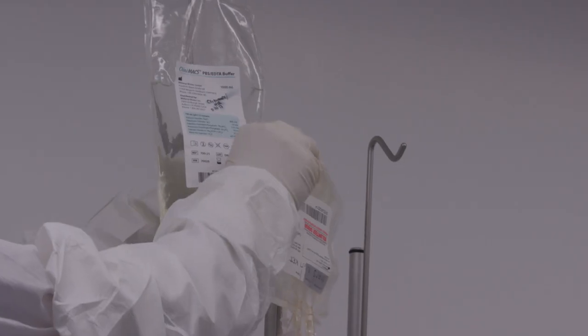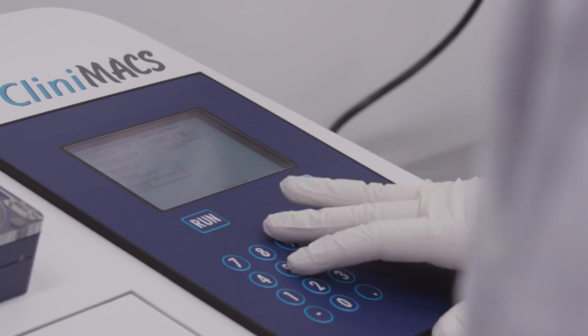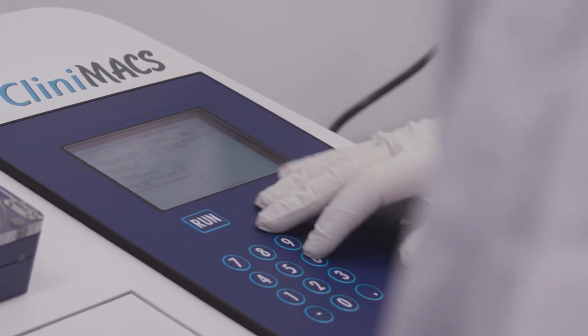Clean rooms are where they work on stem cells and other tissues for genomic research. It's where scientists do work for cell therapy clinical trials.